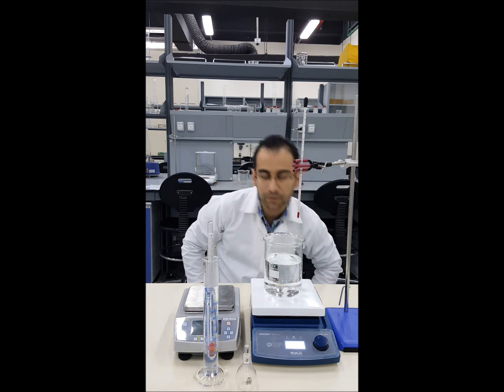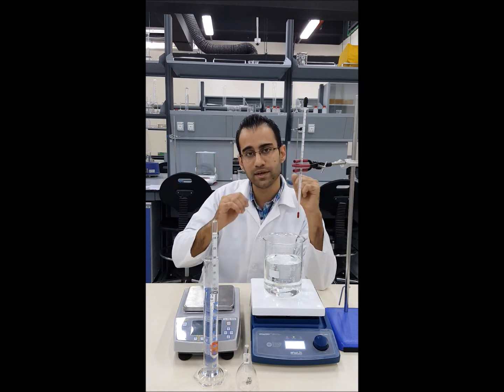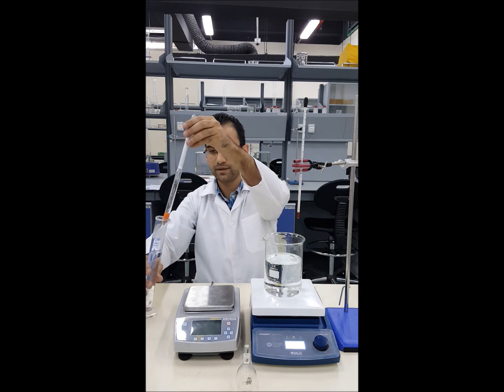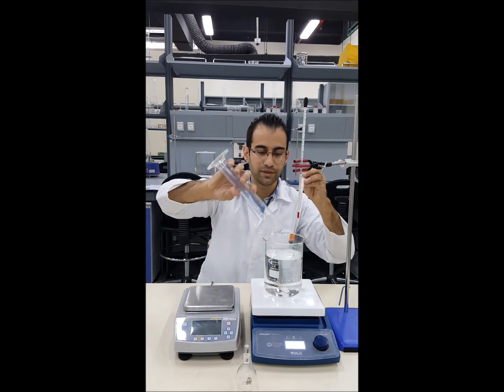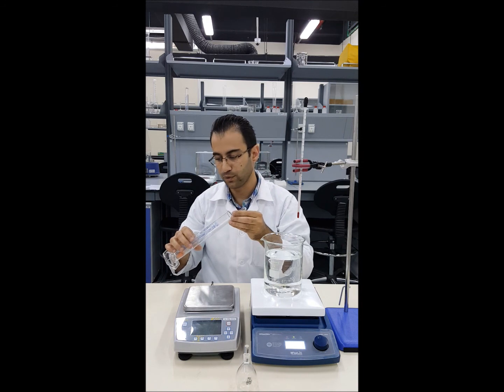I am getting a reading of just under 1 at this moment. Similarly, at that same temperature we are going to use the density bottle. Let's return this water back and I'll show you how to use the density bottle, which works for water or any other liquid.